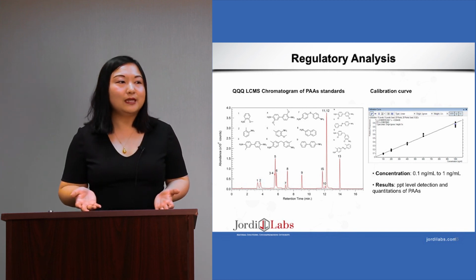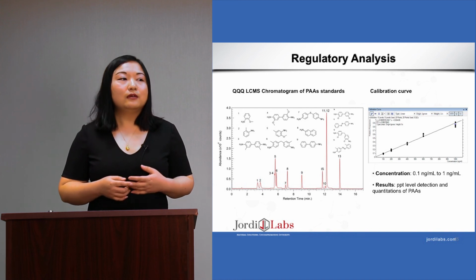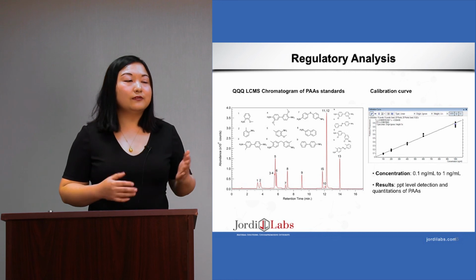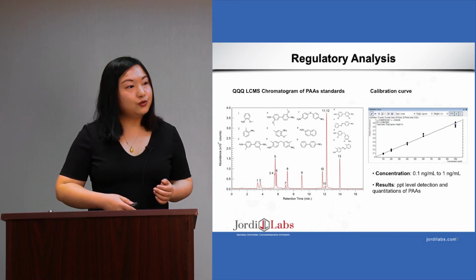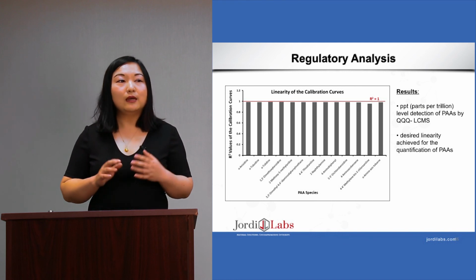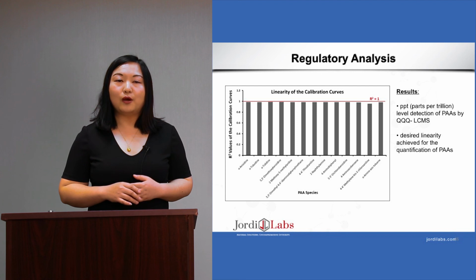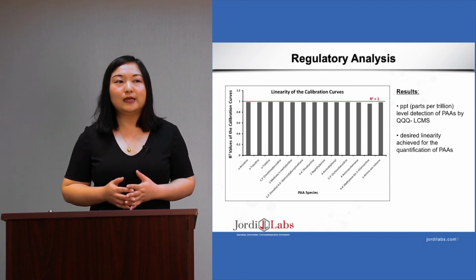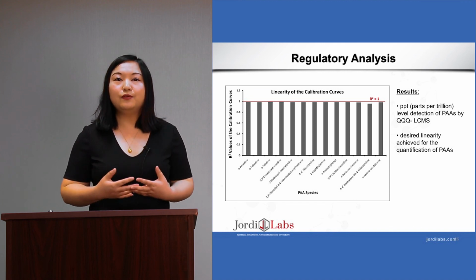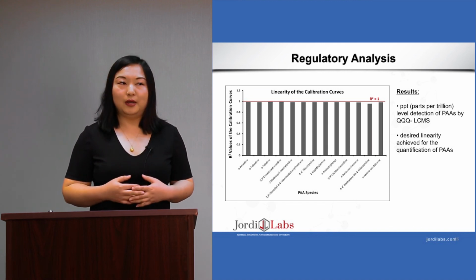It's less than 15 minutes. And another thing is that we can get very linear standard curves from each of these compounds. If I show you the R-square values for all the calibration curves we constructed for each of the standards, you can see they are all close to 1. So this is an indication that the method is very good and can give you accurate quantifications on each of these compounds.